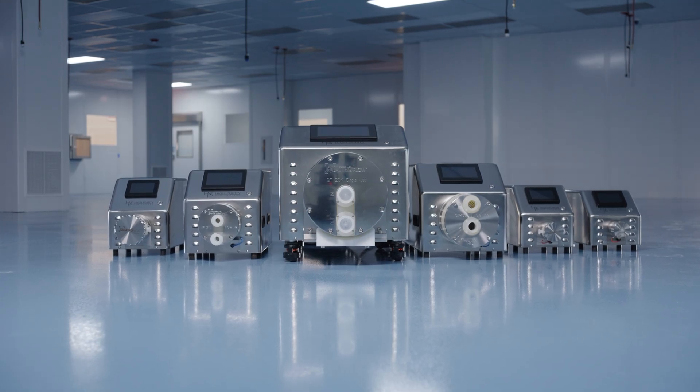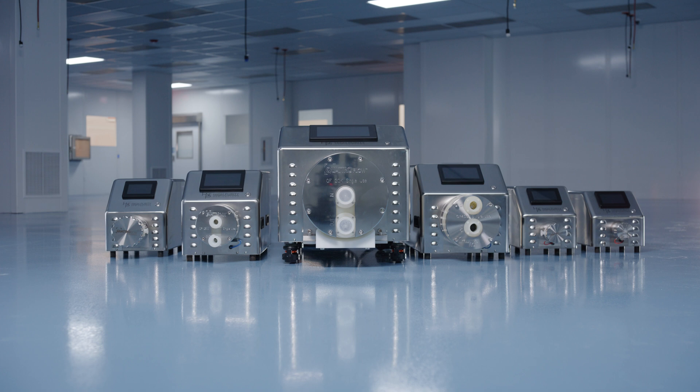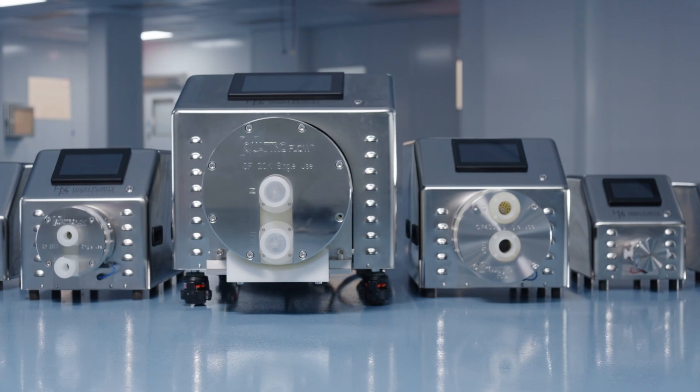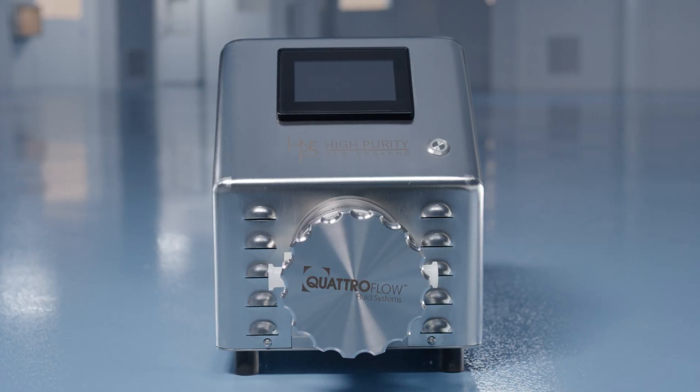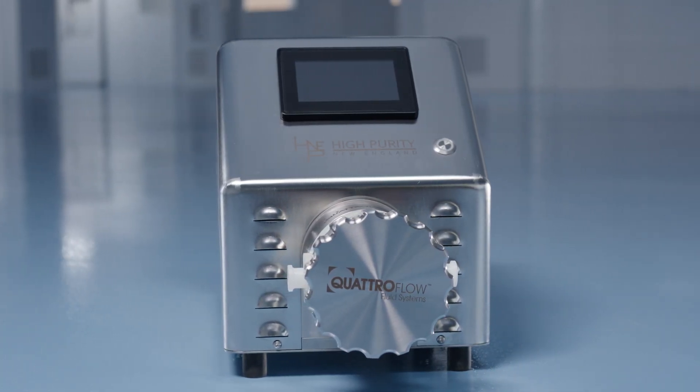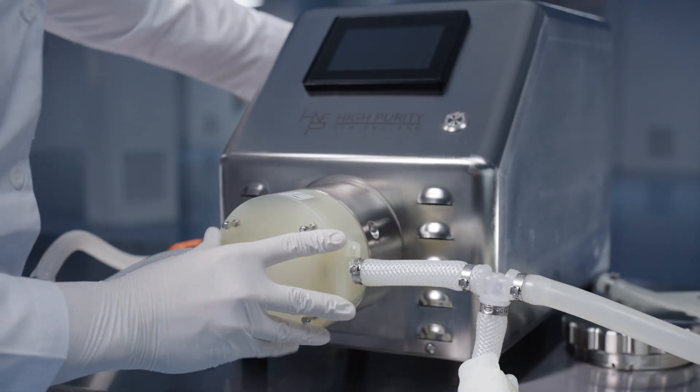Available in a wide range of sizes, Flomax Pro can be used in a number of applications and is ideal for tangential flow filtration, virus and sterile filtration, lipid nanoparticle production, and applications requiring low shear liquid transfers.